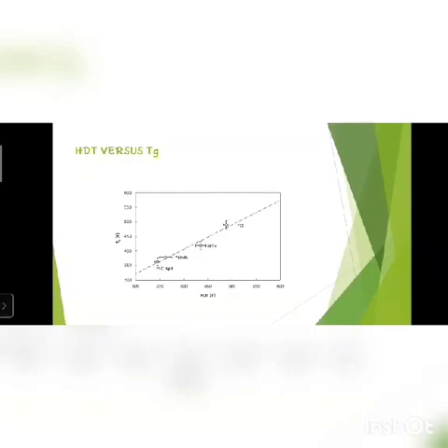We can see that they have higher distortion temperatures compared to each other. Ideally we consider that they have a straight line, but in an actual experiment we don't get a straight line; the experiment deviates from it.